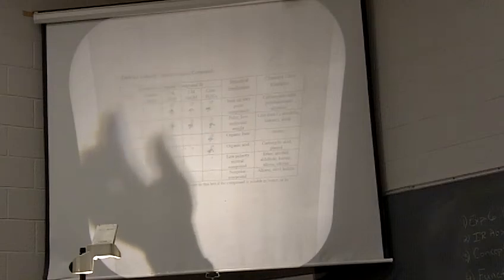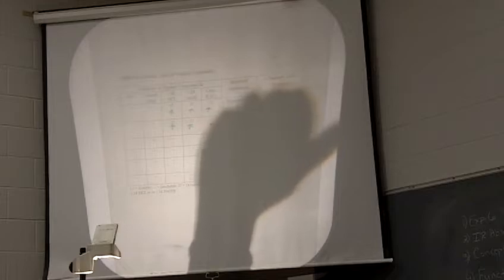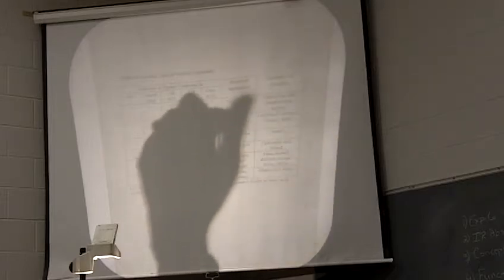You say 3 drops of unknown, so what does that look like for a solid? You'll just use like a few crystals of your solid. So just enough to be able to see it. And a lot of times solids are actually a little bit easier to see than liquids because you're looking at liquids and liquids together.